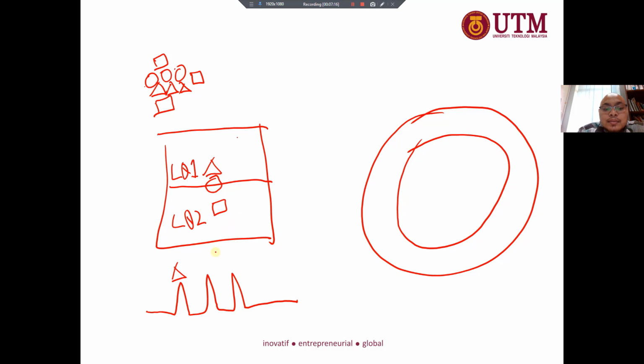The circle will be in the middle, since it has the capability to interact with both phases, liquid 2 and liquid 1. The square, because it loves the stationary phase, liquid 2, the most, will elute last.